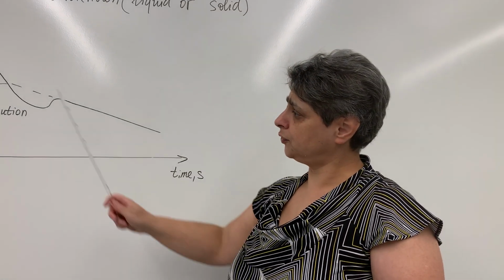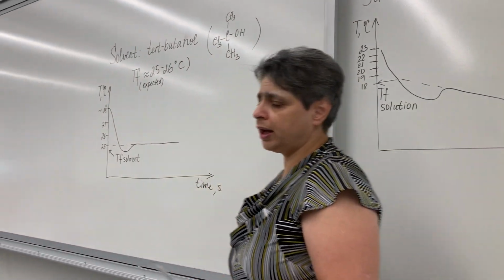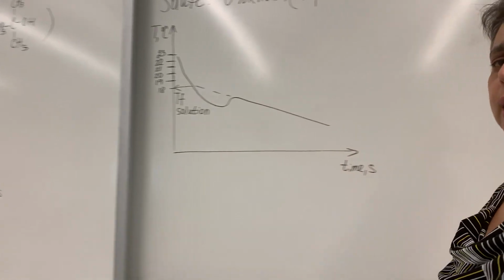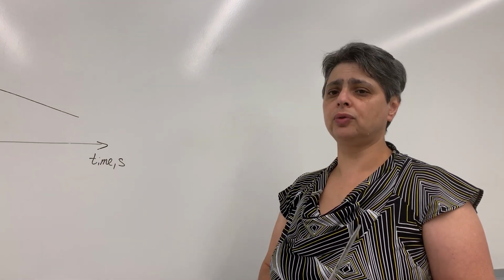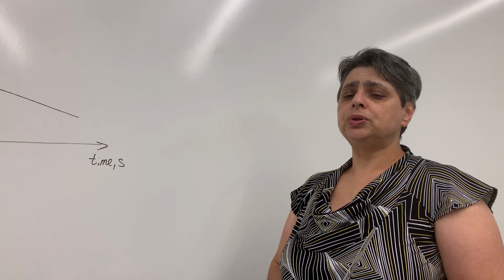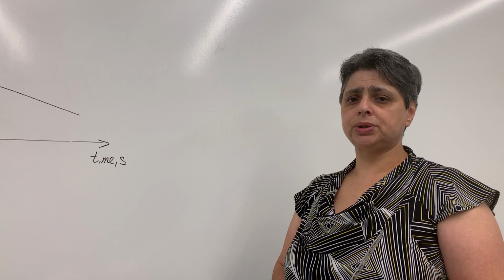Again, once you find your freezing point of solution and freezing point of solvent, you can find the freezing point depression, and based on the freezing point depression and the Kf value given for tert-butanol in the notes, you can then determine the molar mass of the unknown.